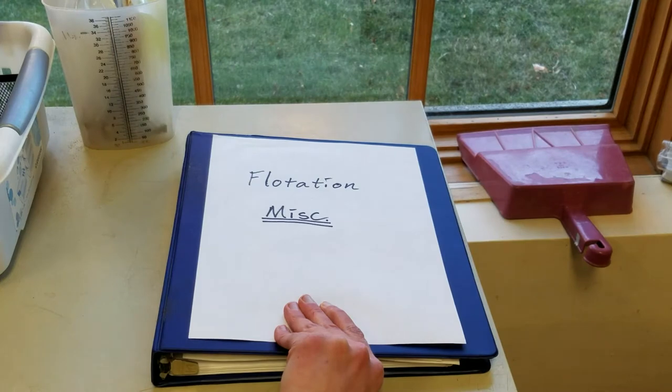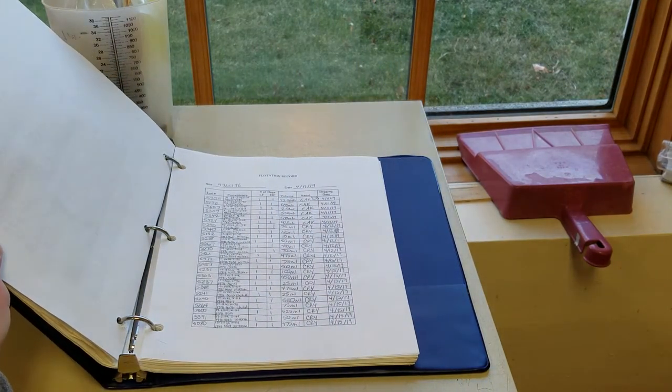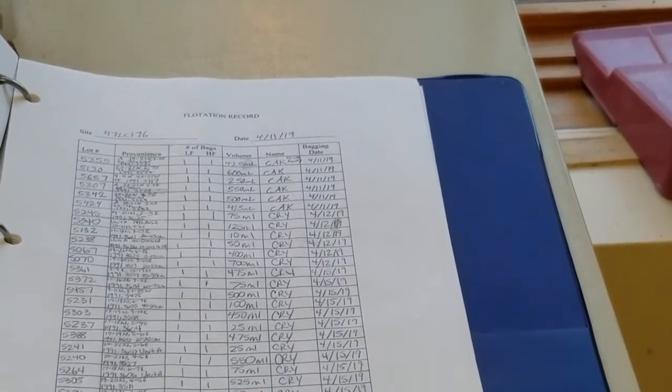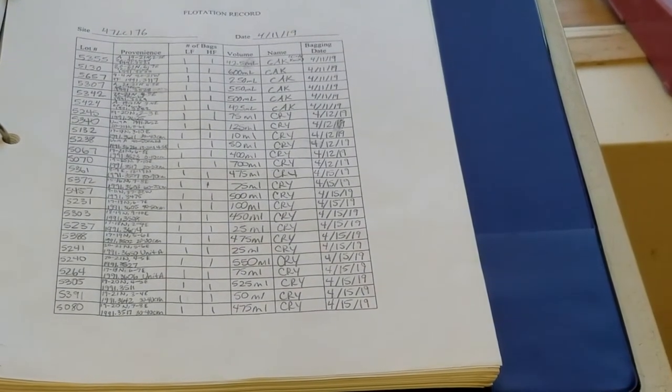Our flotation log helps us keep track of the samples and when they were processed. For each sample, it has the provenience information, soil volume, flotation date, and the person's name who floated it.